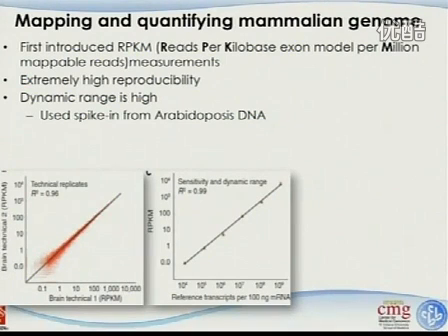Another piece of information that I think we need to take advantage of in this data is that it gives you a good estimation of how many reference transcripts are in the samples that you are identifying. So if you say, I have observed 1 RPKM, this gene is expressed at a level of 1 RPKM, that is equivalent to how many transcripts are in your samples.